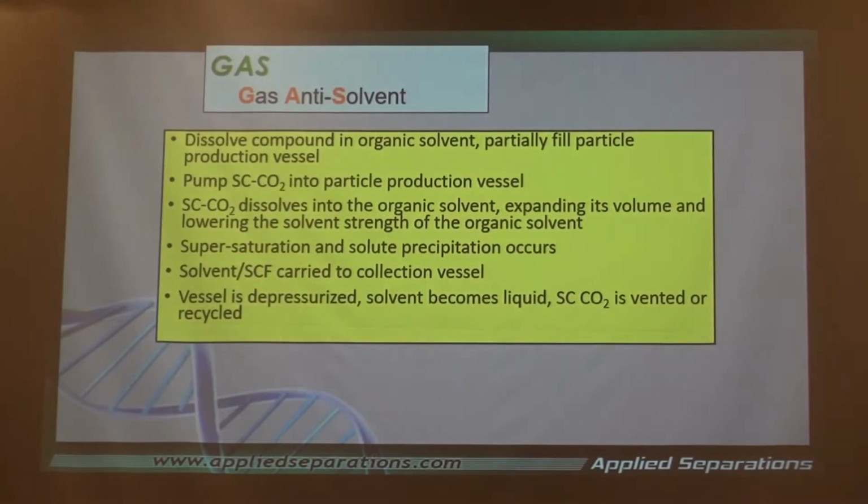Let's talk about gas now. Gas anti-solvent. This is now one of those circumstances where the compound is not soluble in CO2. So we have to use a different technique. We have to use one of the techniques that is gas, PCA, or SEDS. SEDS is a little bit more of a complicated one. We'll just touch upon that one. But let's talk about gas.